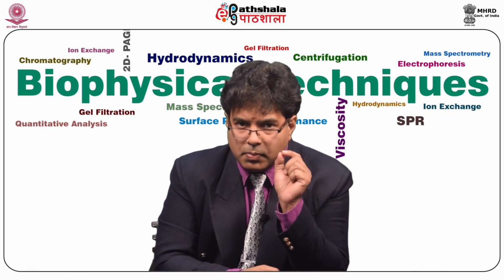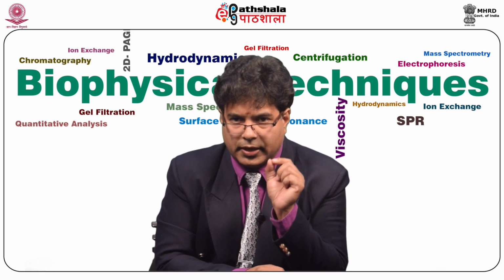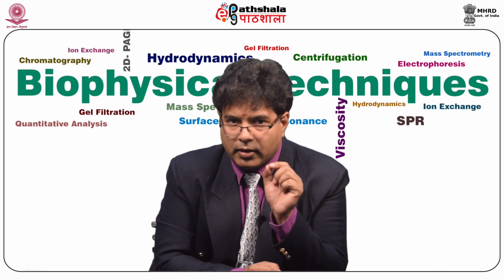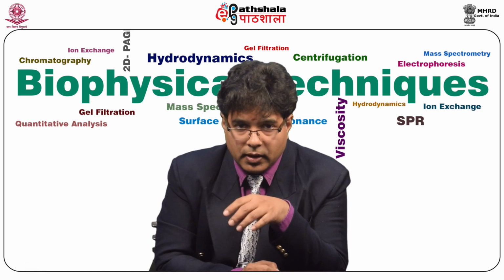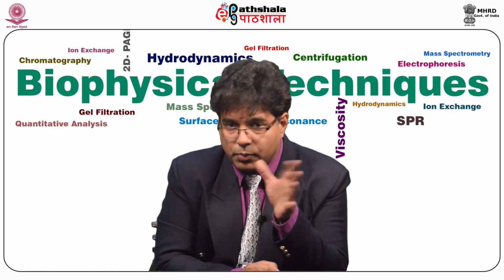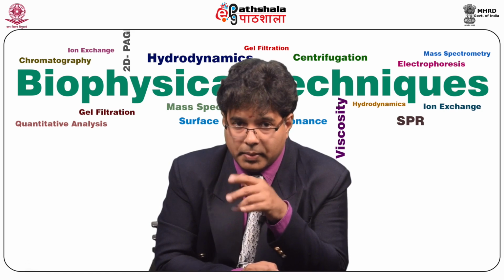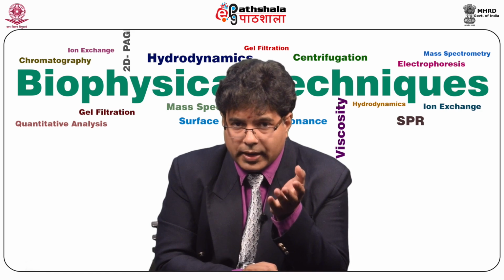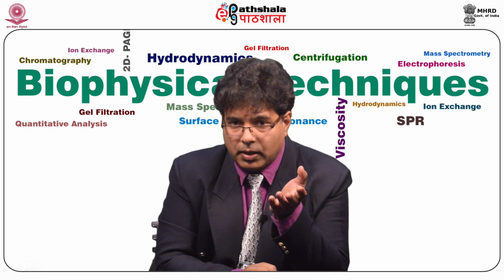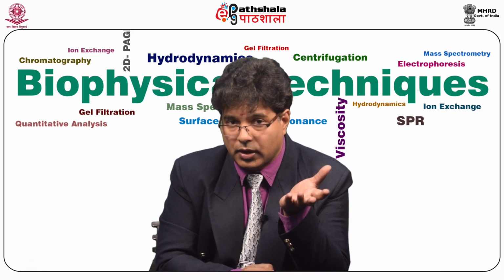This mass accuracy depends upon the resolution we are trying to achieve. The resolution of an ion, like sensitivity and dynamic range, based on the choice of mass analyzer, could vary from 0.5 to 0.0001 m/z. For accurate mass, plus or minus 5 ppm of the theoretical molecular weight is a must, so that we understand exactly the molecular weight of the compound.